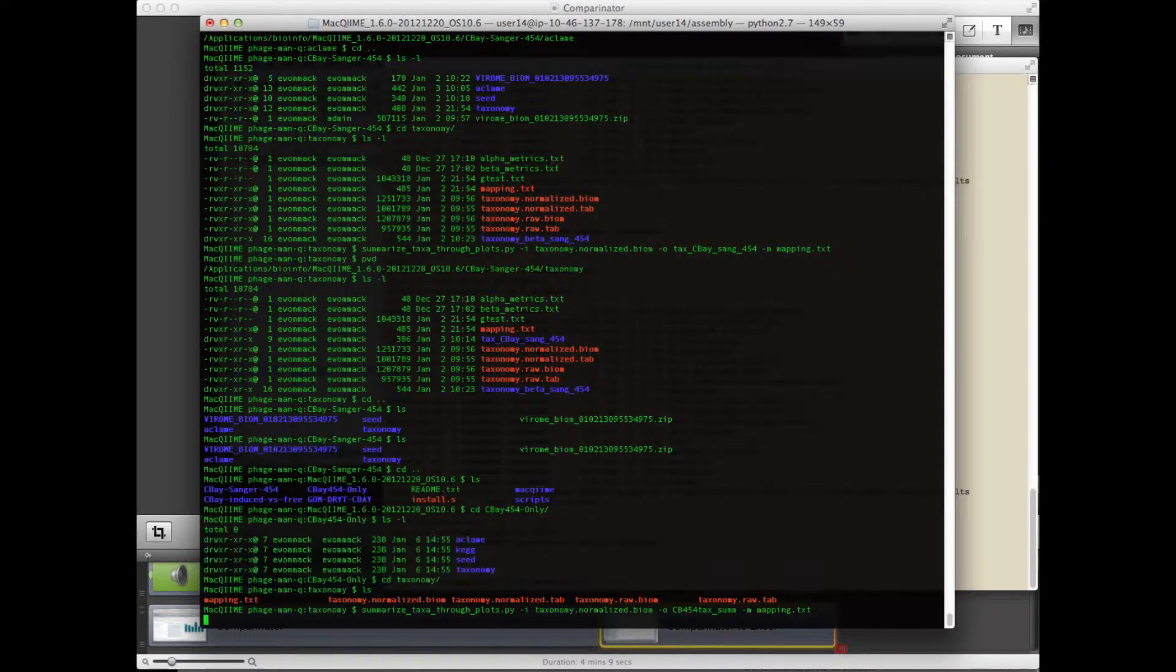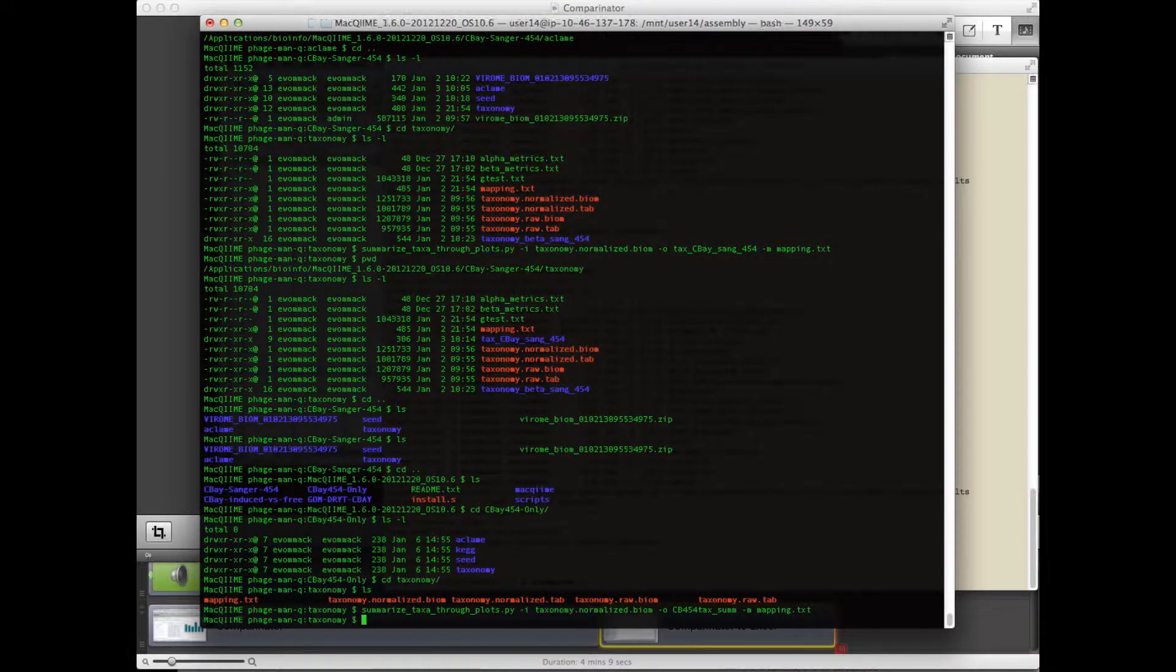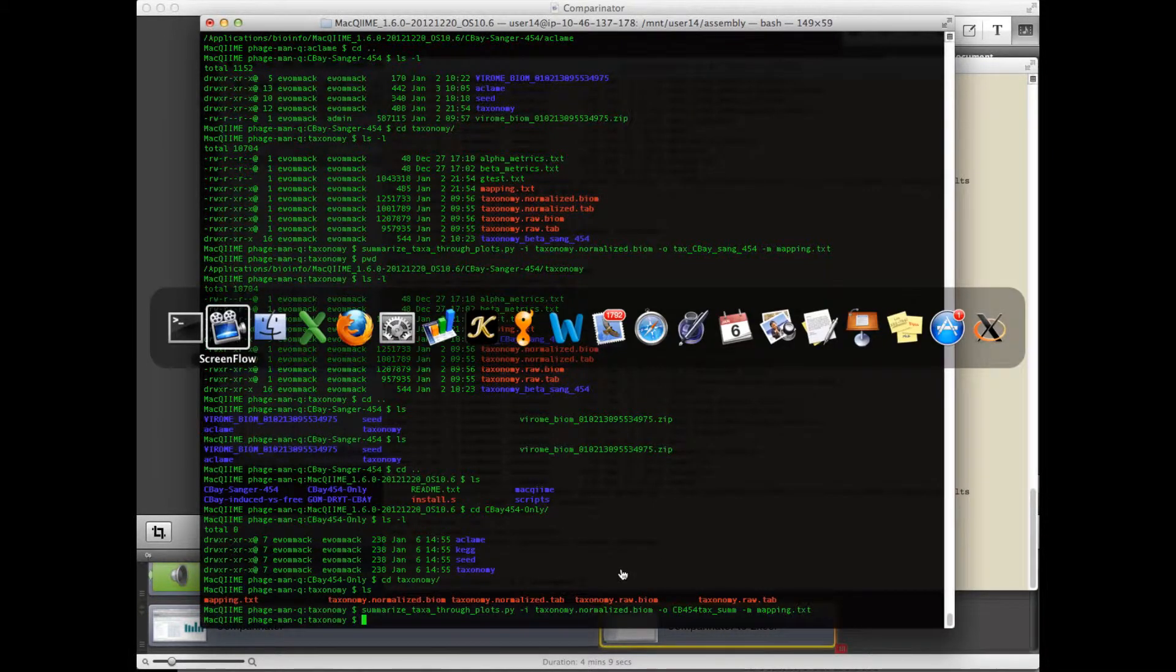And CHIME will run through this and generate frequency histograms, or I'm sorry, stacked bar plots, based on the taxonomic data we just created in Viroome. So that script is done.